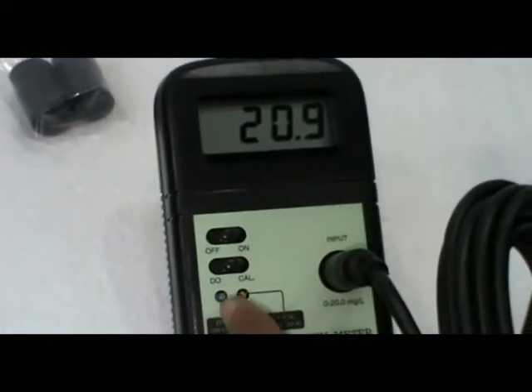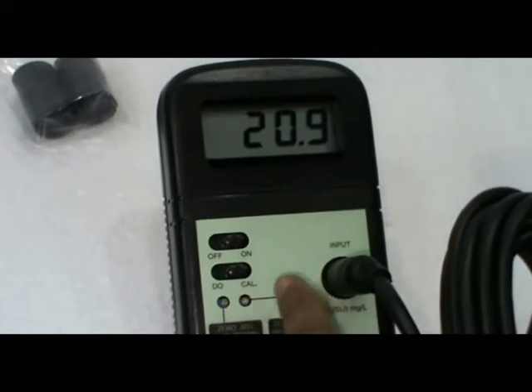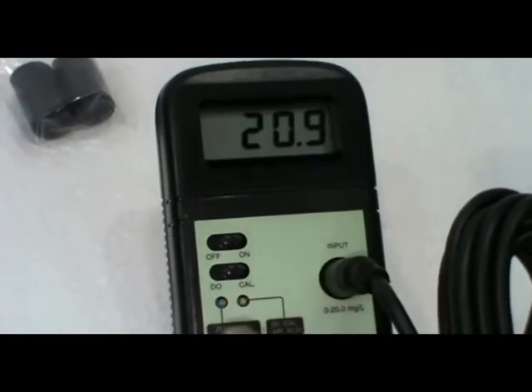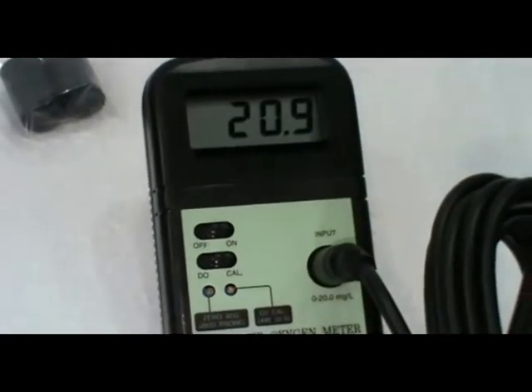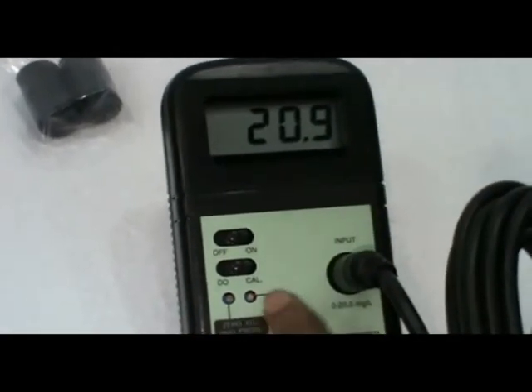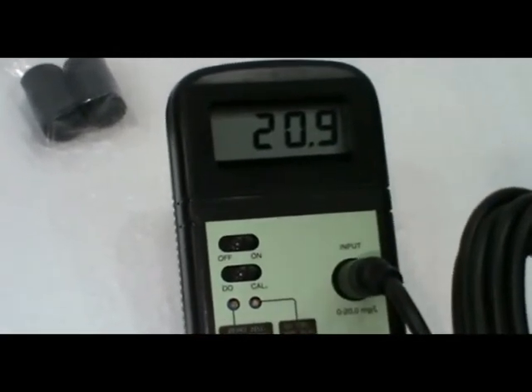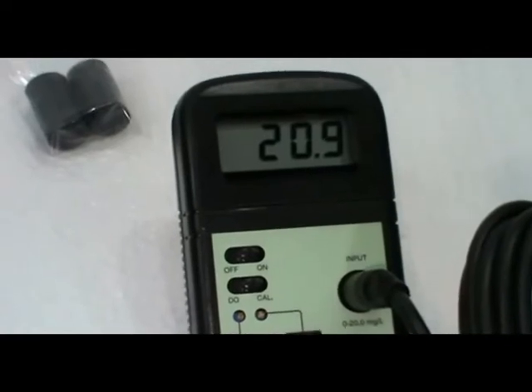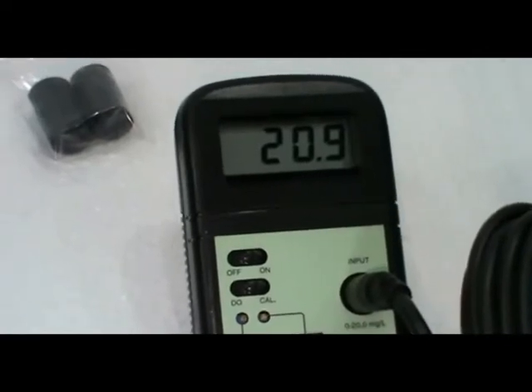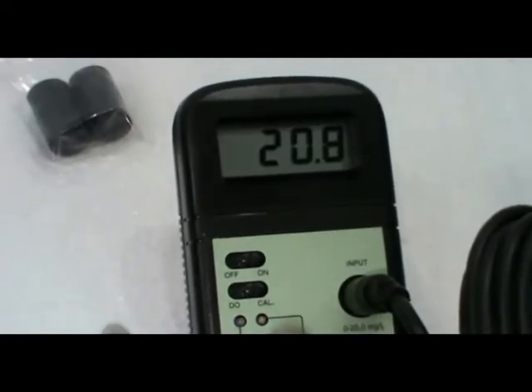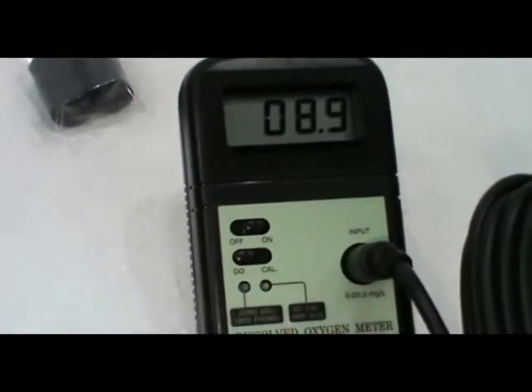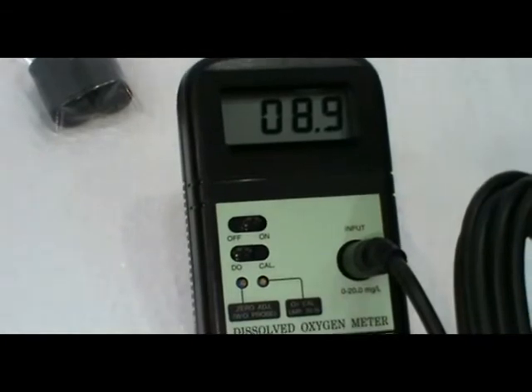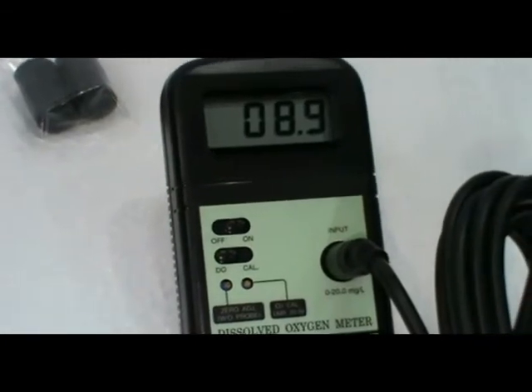Set the value 20.9 in display and adjust the screw in the mode. Check the sample with closed container.